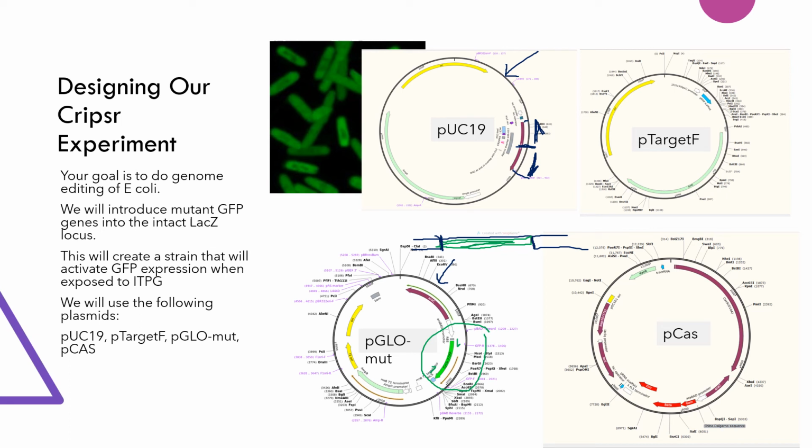And so then once we have those two pieces, we have our pUC19 kind of backwards and opened up here, so it still has AMP on it, right? Still has AMP on it. It still has part of LacZ on it here where we opened it up. It still has an ORI, right?